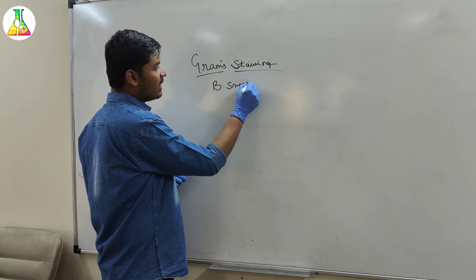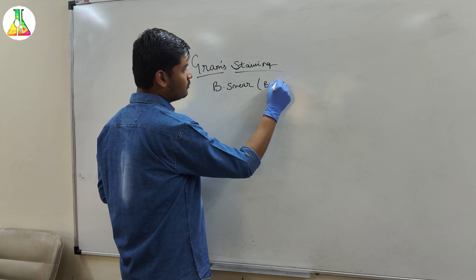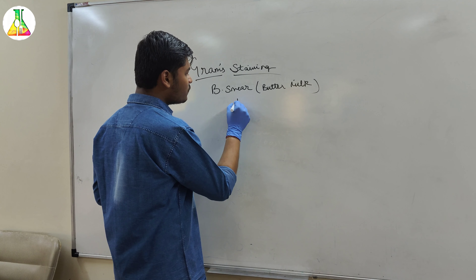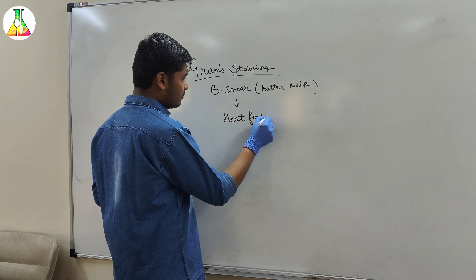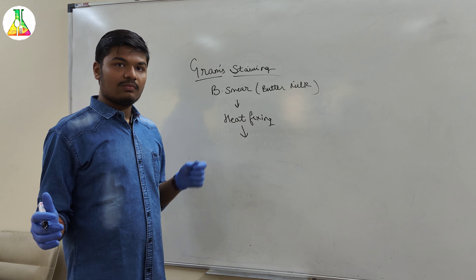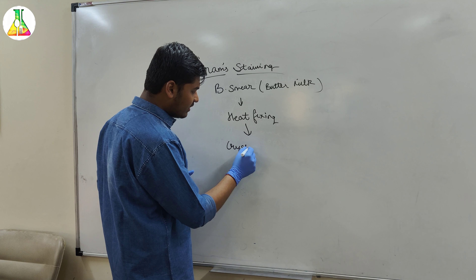You can still see how the smear has got stained. This will be followed by the addition of the Gram's iodine. We will take a dropper and put a few drops of Gram's iodine on the slide. We will let it remain like this for 30 seconds.